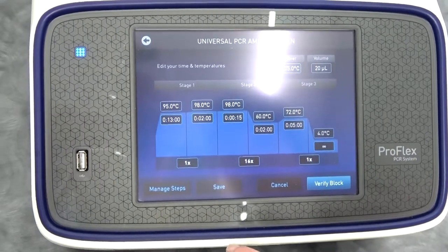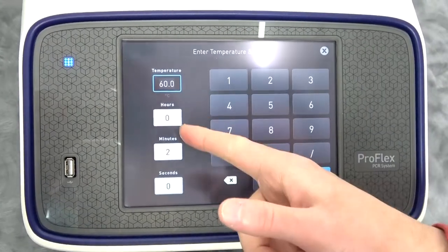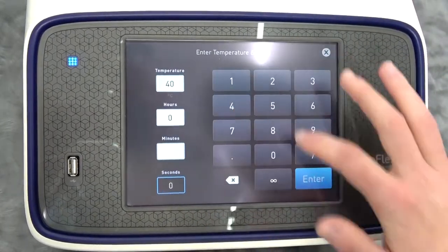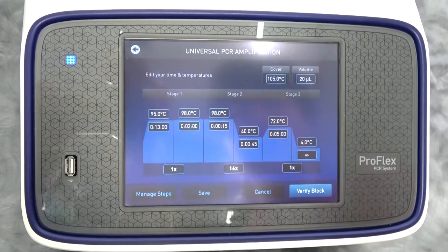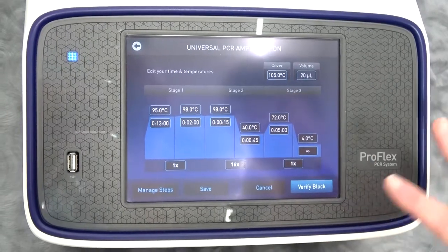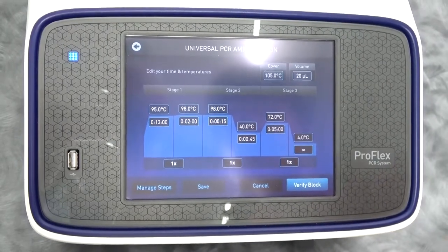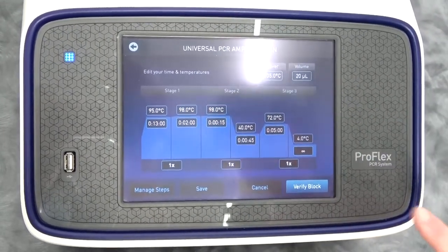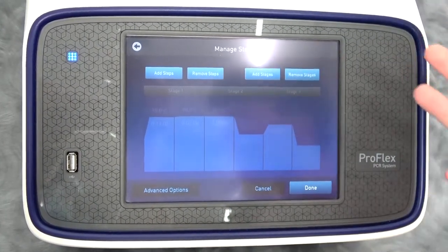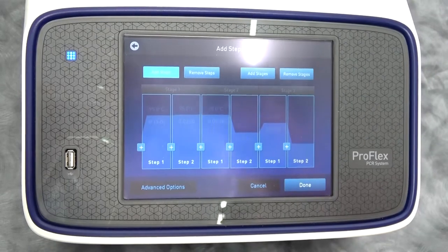I'll show you how to manipulate one of these runs — it is a cakewalk. If you want to adjust temperatures, you can do that right on this screen. Hit any temperature you like and you can change it, say, to 40. You can change how many minutes you want — say three minutes or 45 seconds. I've changed it and you'll see it reflected on the graph. You can also modify the number of cycles. You can also remove steps or add steps right on the graph, or remove entire stages or add entire stages.